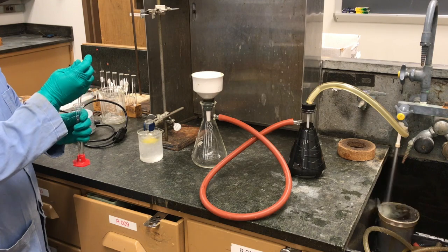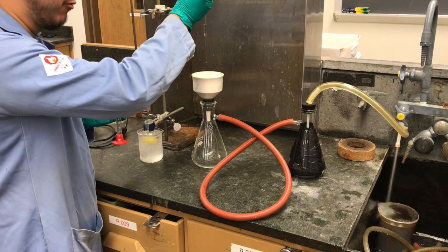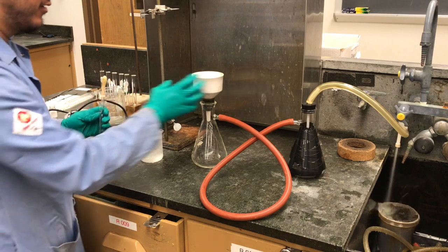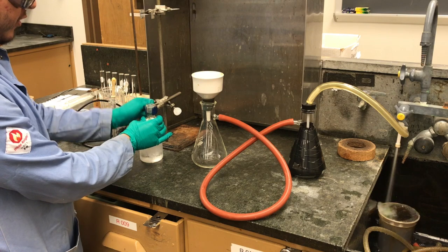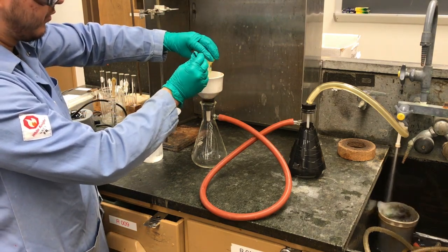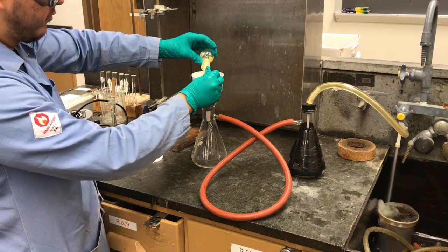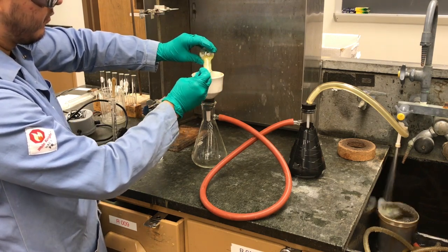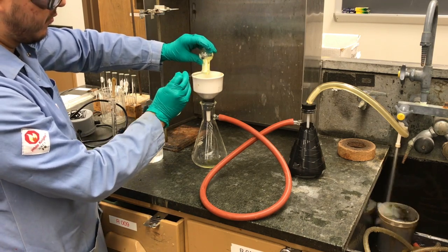Okay, so after 15 minutes, we're ready to do our vacuum filtration. So we're going to wet this filter paper with a little bit of cold ethanol. So we're going to pour our product into the funnel, and it's a pretty thick mixture, so we're going to use our spatula to try to get as much of the solid out as we can. And we're going to use fresh ethanol to keep washing our flask to try to get as much of the product as we can out.